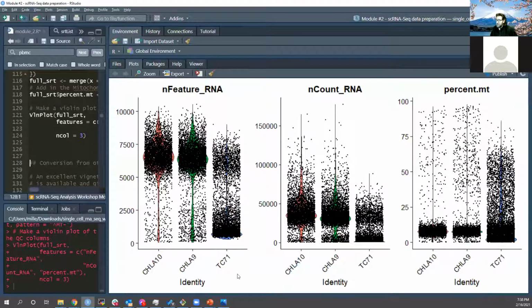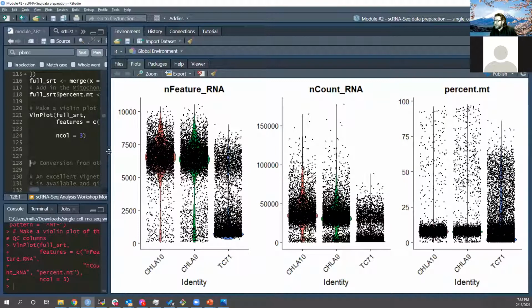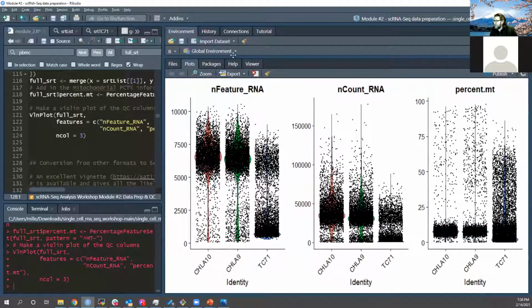So this is another Ewing sarcoma cell line, just like these 2 are. So really, it shouldn't be that terribly different. And in fact, when we redid the data later in our new run through Cell Ranger, it actually turned out fine. In future papers, that will get made available. We just didn't have that at the time we did this.